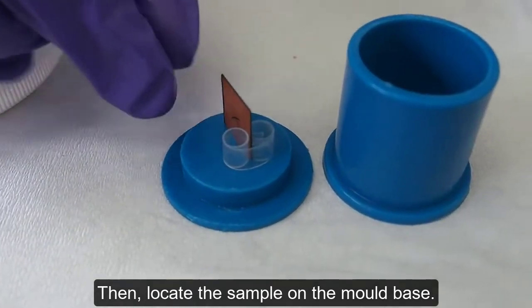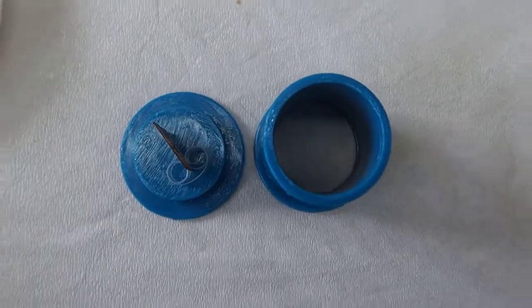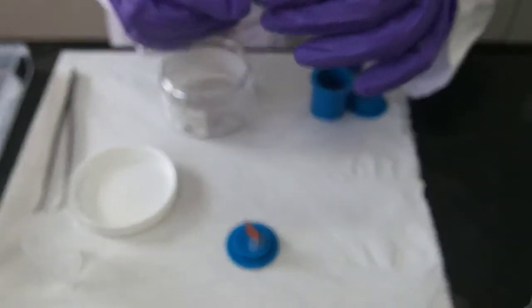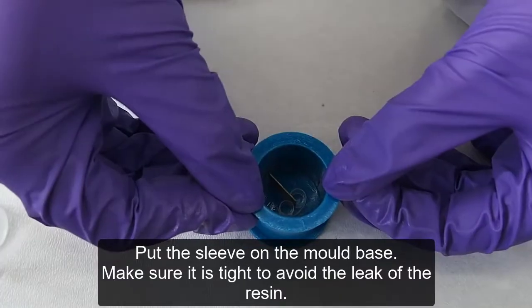Locate the sample on the mold piece. Put the sleeve on the mold piece and make sure it is tight to avoid any leaking of the resin.